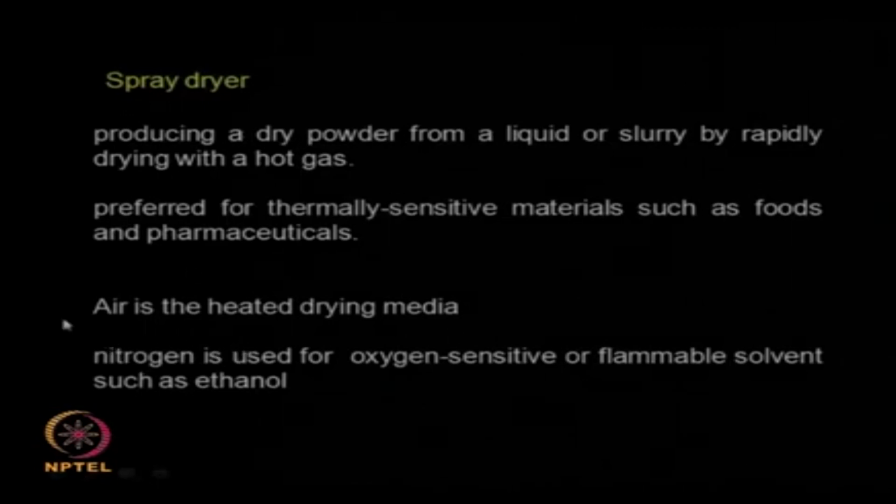We can use nitrogen if you think the oxygen present in the air can lead to flammability or oxidation and so on. So if your solid contains even a flammable solvent, then oxygen free nitrogen may be used as the heating medium for this material.